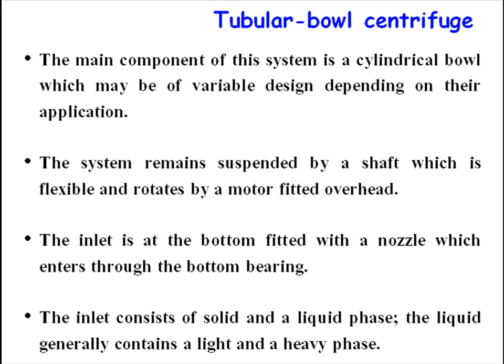Second is tubular bowl centrifuge. The main component of this system is cylindrical bowl, which may be of variable design depending on their application. The system remains suspended by a shaft which is flexible and rotates by a motor fitted overhead. The inlet is at the bottom fitted with a nozzle which enters through the bottom bearing. The inlet consists of solid and a liquid phase. The liquid generally contains a light and a heavy phase.